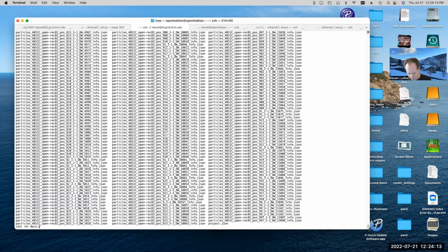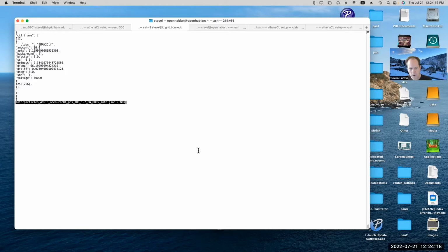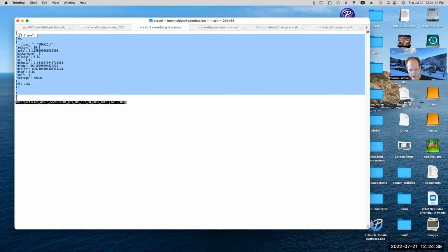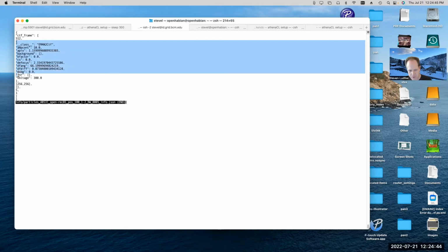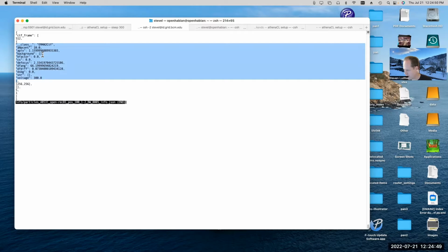So if we look at one of these files, you can see it's human readable, and it looks kind of like a program, right? You've got the open curly braces, and then we've got CTF frame colon. So this is basically like a dictionary in Python. And then the CTF frame leads to a list, and the list contains a number, and then it contains another dictionary. The dictionary contains the CTF parameters. So this is a hierarchical file format.